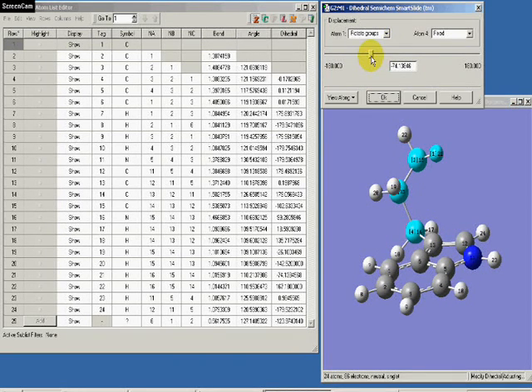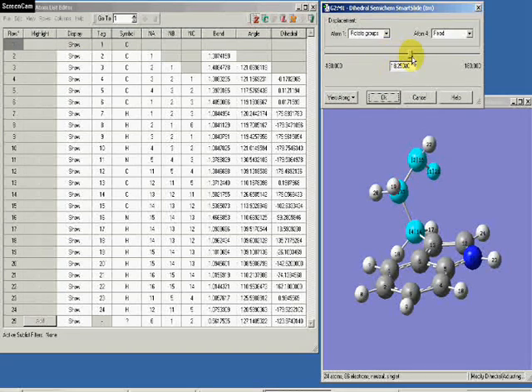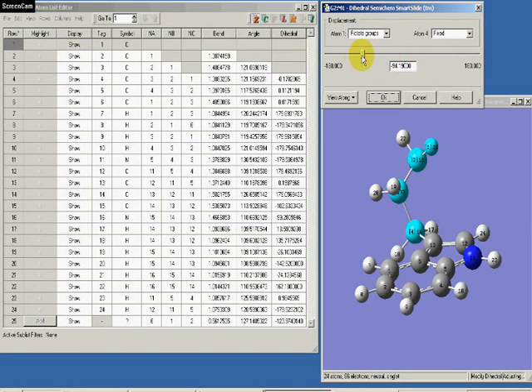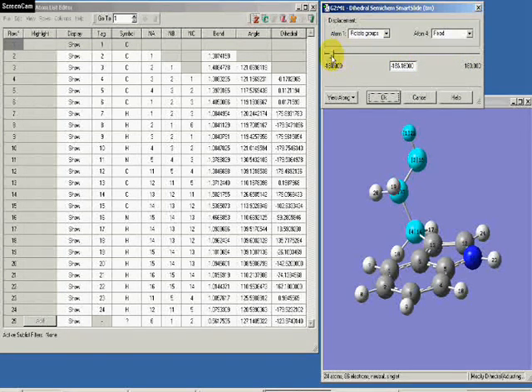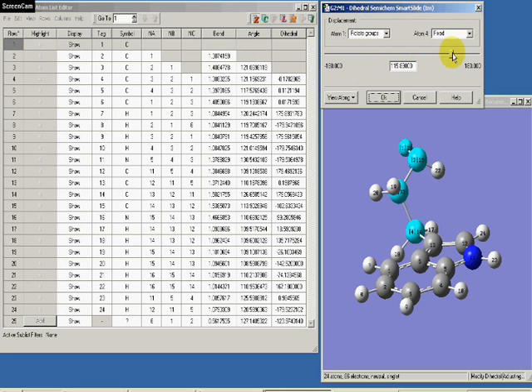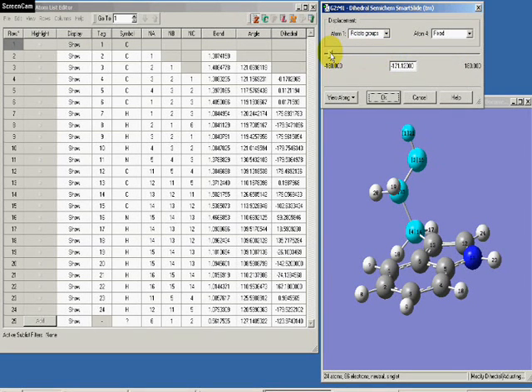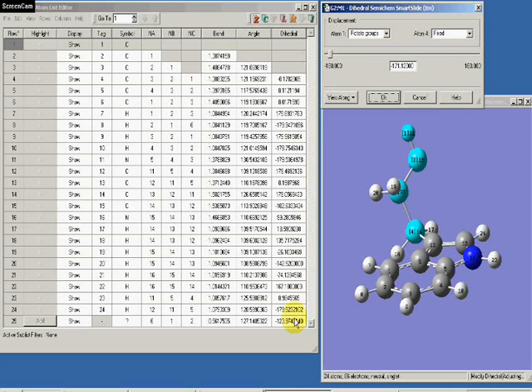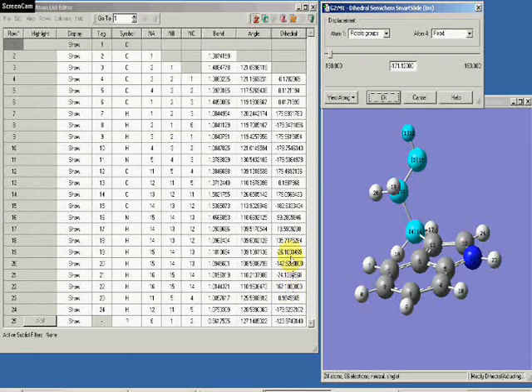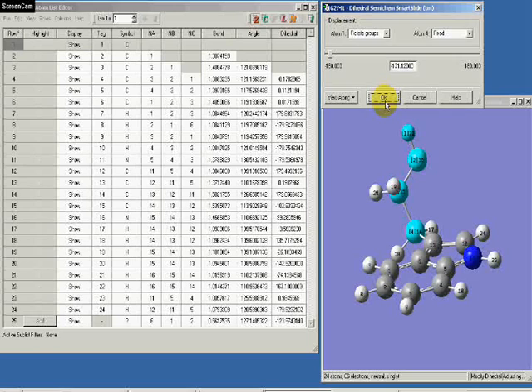So you can see that when I rotate the angle over here in the dihedral scheme smart slide, I can do it very simply, very easily. But the problem is that if you look at the Z matrix over here, once I press OK, then several of the angles will change.